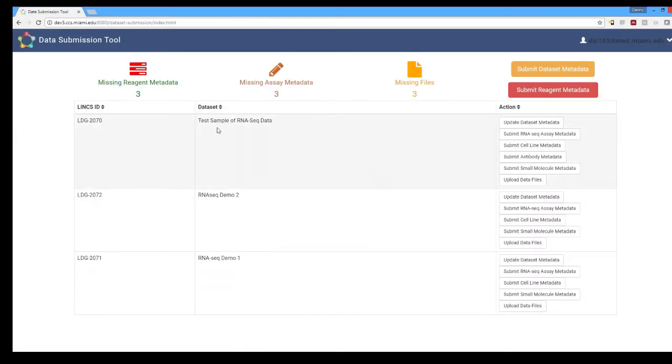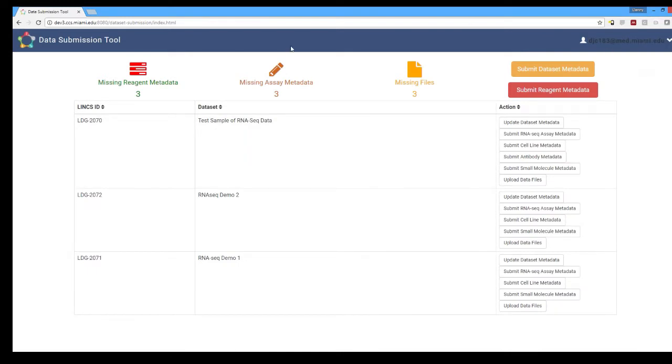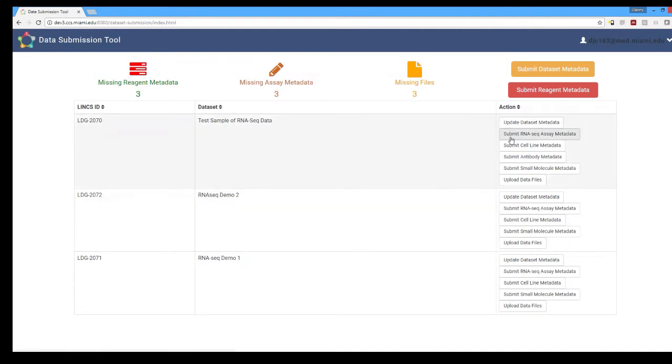At the top you can see we're on the data submission tool and get some basic info about your account. In addition, you can see how many of the datasets that have been submitted are missing certain aspects. You can highlight the individual datasets and on the right side you can click buttons to submit anything that's missing.